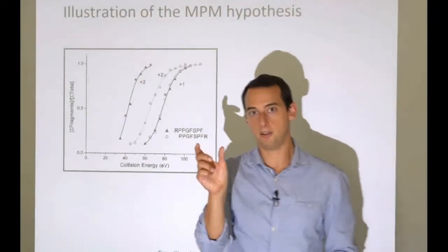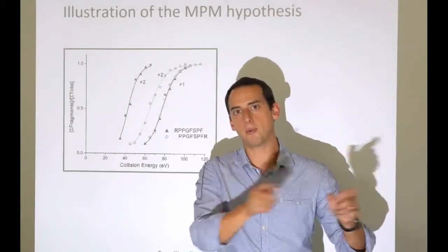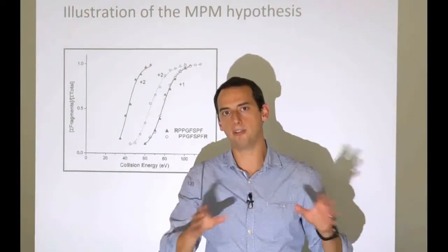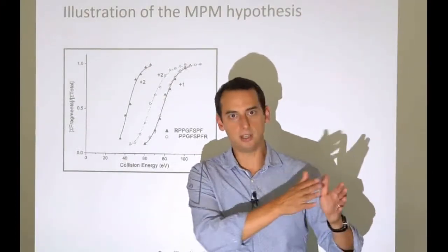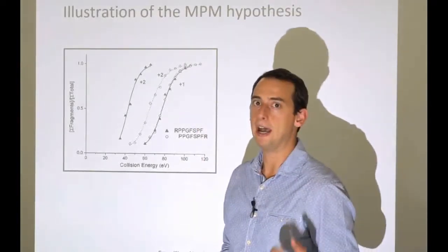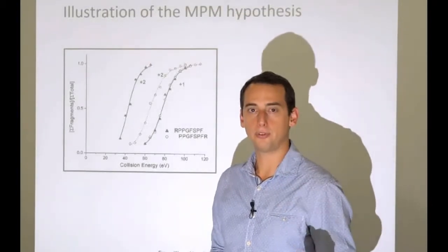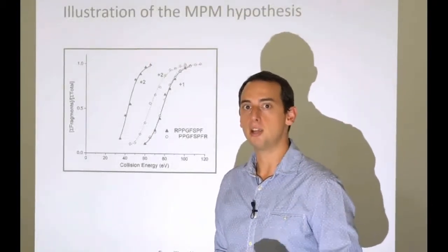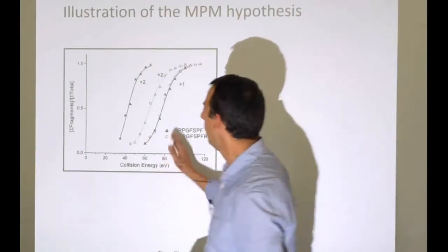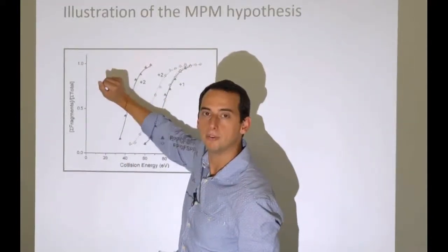We have the Y1 ion, we have the Y2 ion, the Y3, the Y4, the Y5. We have all these ions somewhere in the spectrum. So we've completely blown everything sufficiently apart to see the full ladder of all possible Y ions. It's a great way to see how easy it is to fragment. And remember, a more mobile proton should make for easier fragmentation. So the more mobile a proton is, if the model is correct, of course, the less energy we need to get to a high amount of coverage.